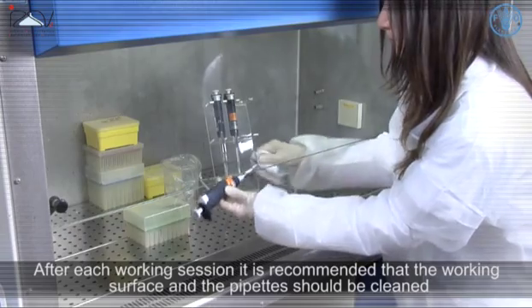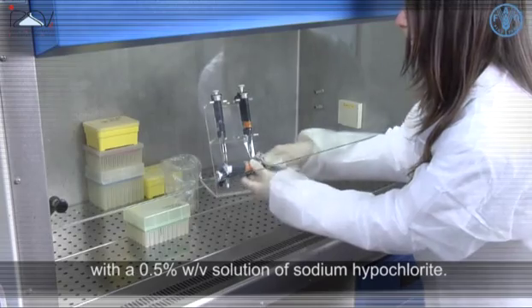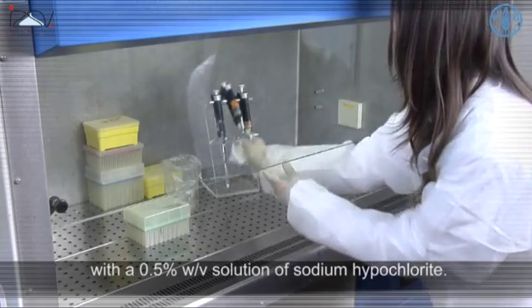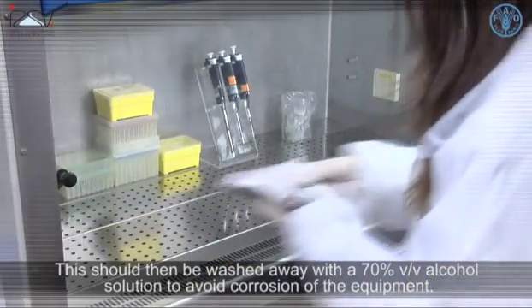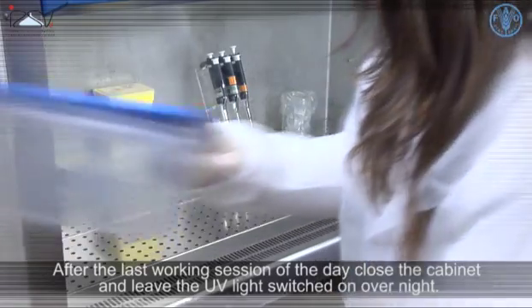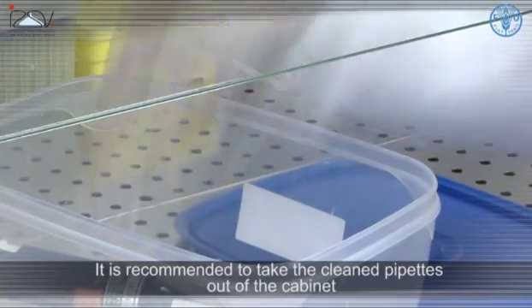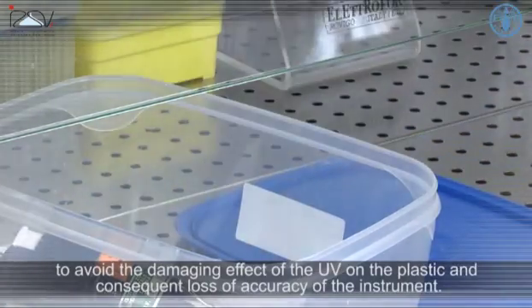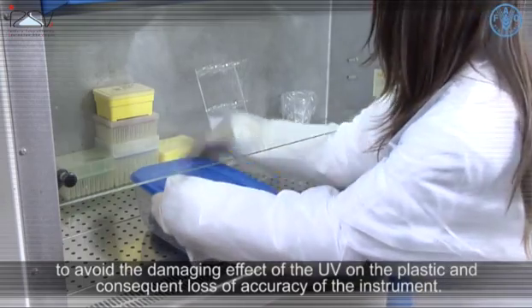After each working session, it is recommended that the working surface and the pipettes should be cleaned with a 0.5 percent solution of sodium hypochlorite. This should then be washed away with a 70 percent alcohol solution to avoid corrosion of the equipment. After the last working session of the day, close the cabinet and leave the UV light switched on overnight. It is recommended to take the cleaned pipettes out of the cabinet to avoid the damaging effects of the UV light on the plastic and the consequent loss of accuracy of the instrument.